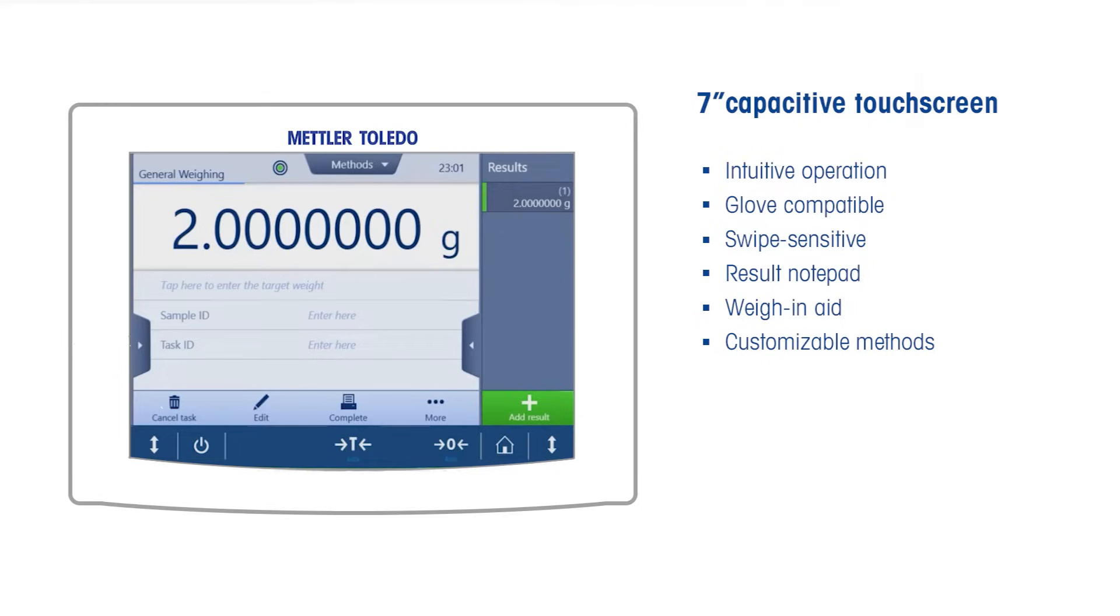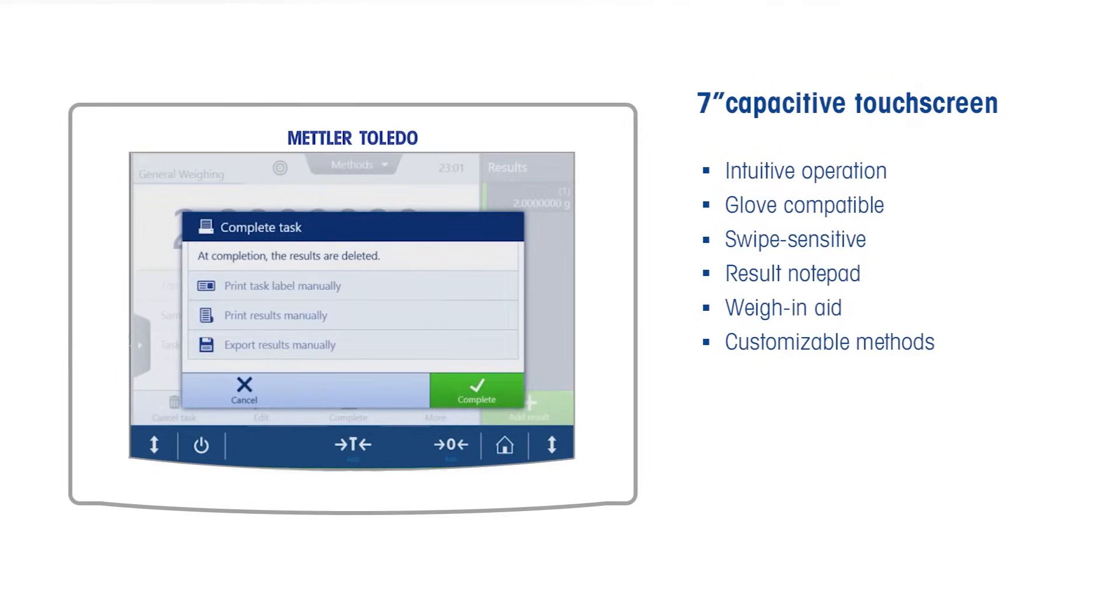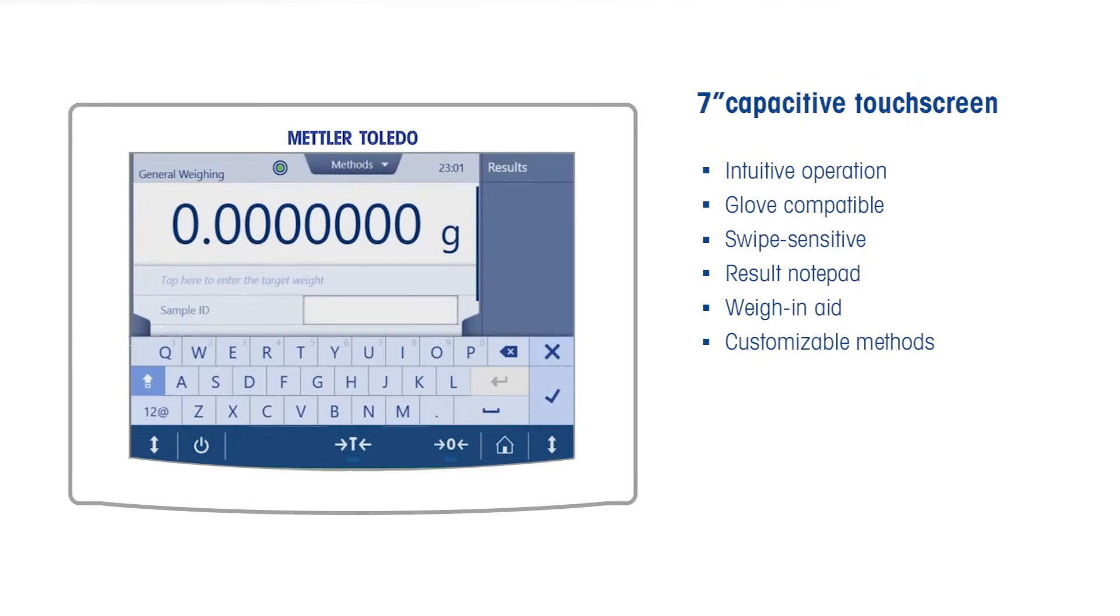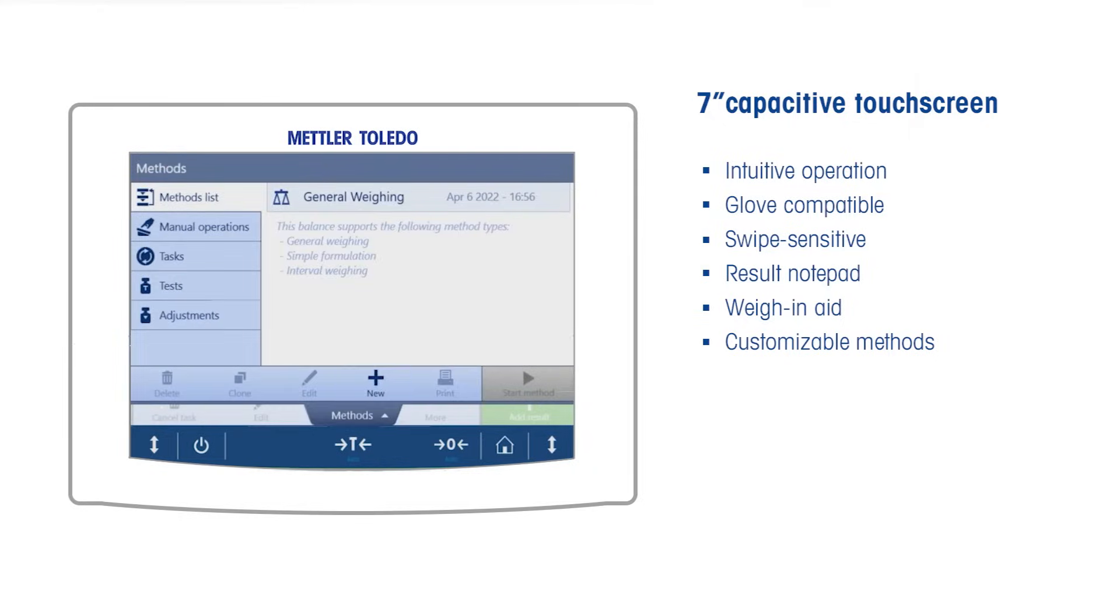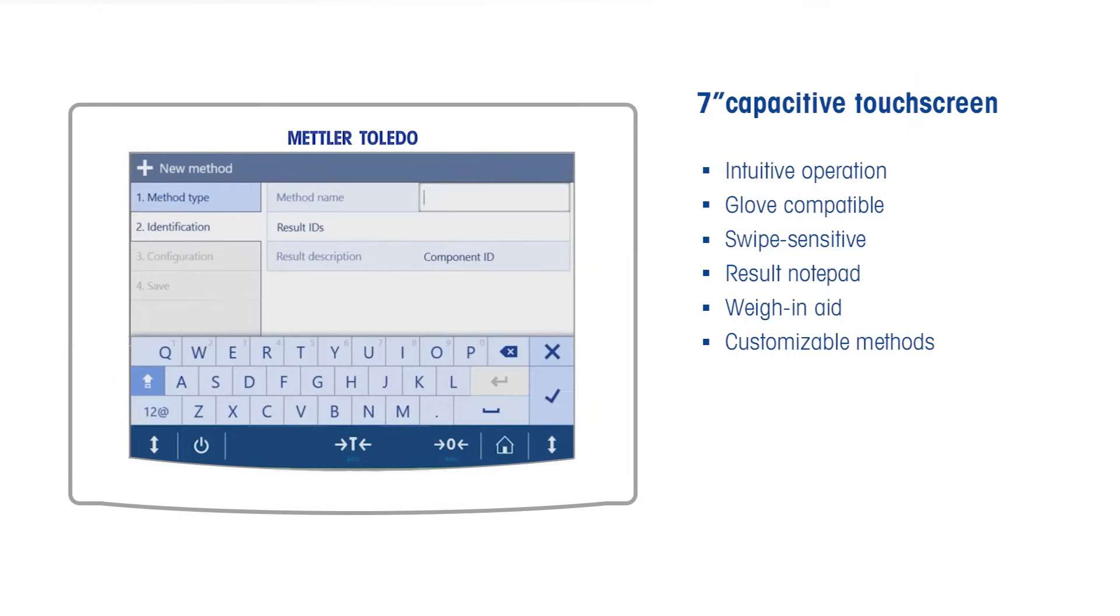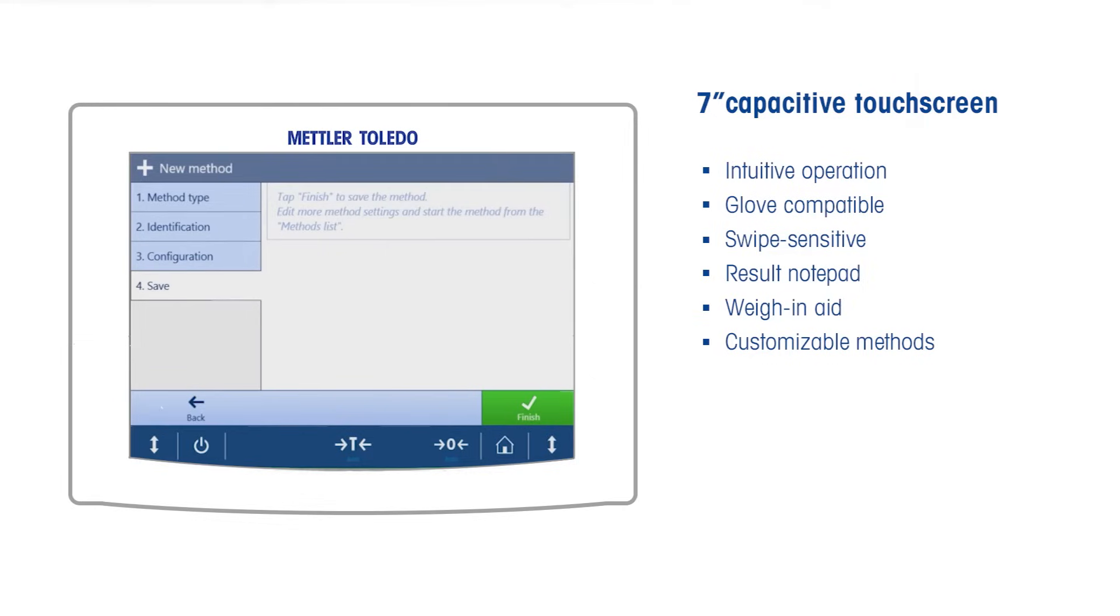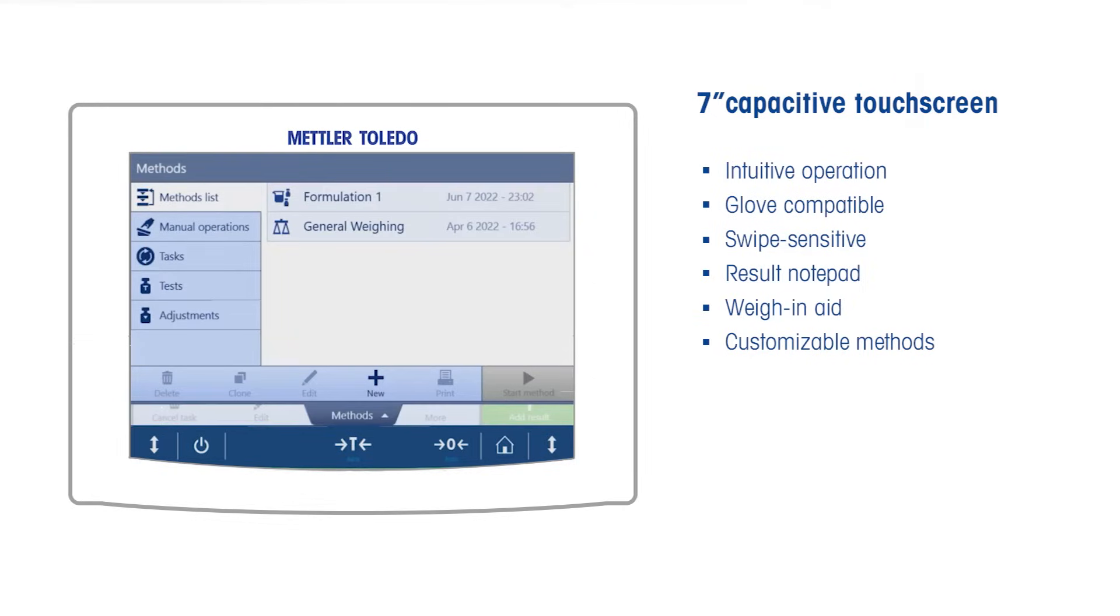The result list is always in sight and can be easily transferred to your lab journal. With one click, you can set a sample identification or activate a weighing aid that fits your tolerances. Process and balance settings for different weighing tasks can be saved as individual methods. This offers you a quick and simple way to start tasks and ensure users follow the same procedure. And whatever regulations you must comply with, we have your back.